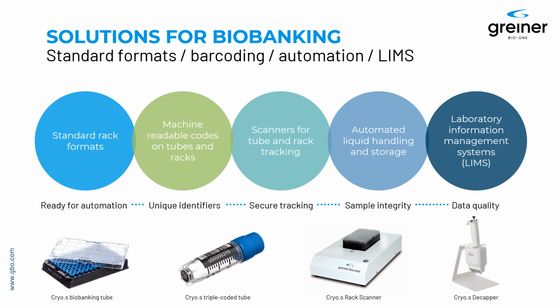Another feature of labware is that the tubes and the racks usually are endowed with machine-readable barcodes. I mentioned them already earlier. And these barcodes allow for the machine-readable identification of their unique identifiers.